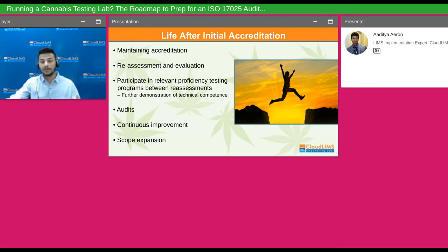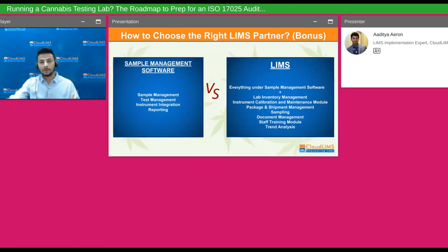And once that is done, you can also make sure that if ever you later on are willing to expand your business operations, let's say today, like I said, you're only working on a potency test and tomorrow you're working on a full panel test, you're adding more feathers to the cap. So you can then let the accreditation body know, and you'll have to reapply for this new scope that you're now expanding into. Every activity, every service, every job that you're doing in the lab needs to be informed to the accreditation body, because only if you do that, you would earn an accreditation for each of the activities worked upon by your laboratory.